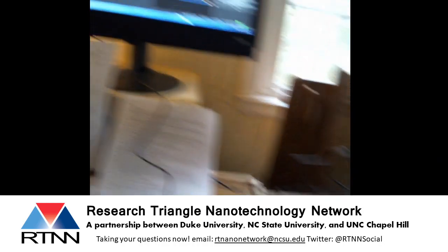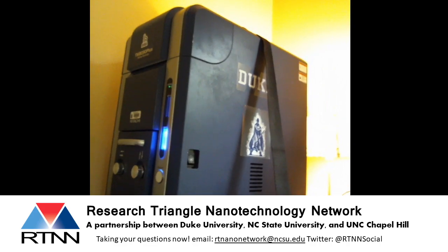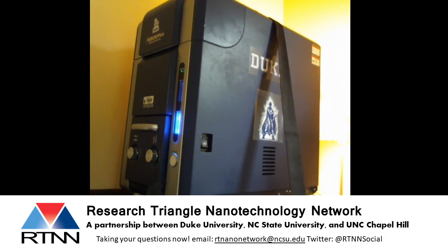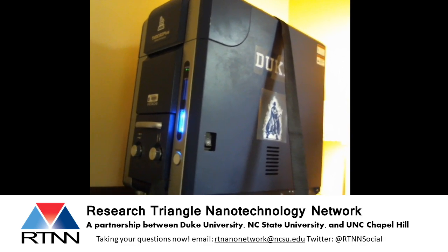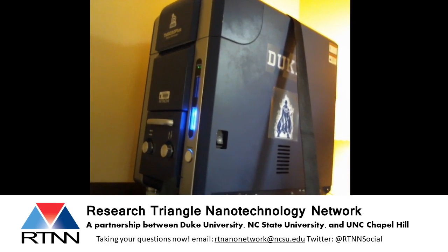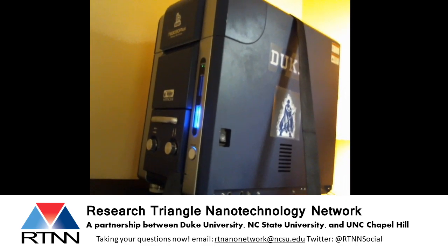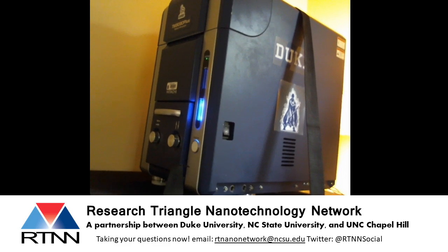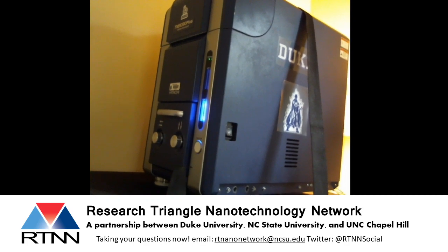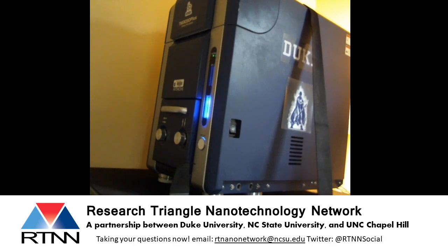The other microscope that we have for you today is a scanning electron microscope. A scanning electron microscope is going to use electrons instead of light to take pictures. It's a little bit less exciting looking and a whole lot bigger than that light microscope. But in fact, for an electron microscope, this is a really, really tiny one. Our biggest microscope in the lab is so big that it takes up a whole big room, not just a regular size room, a really, really big room.